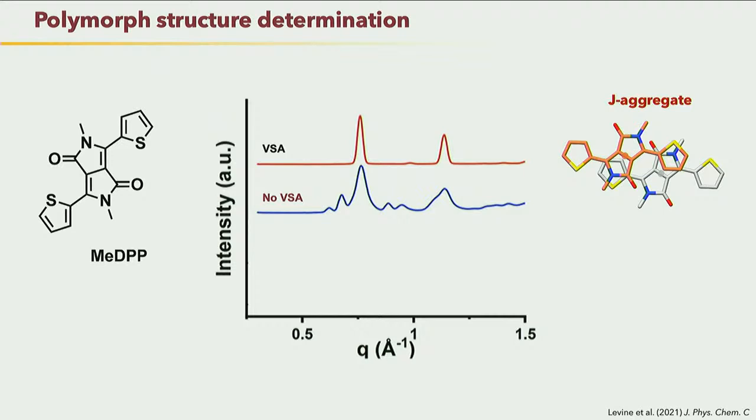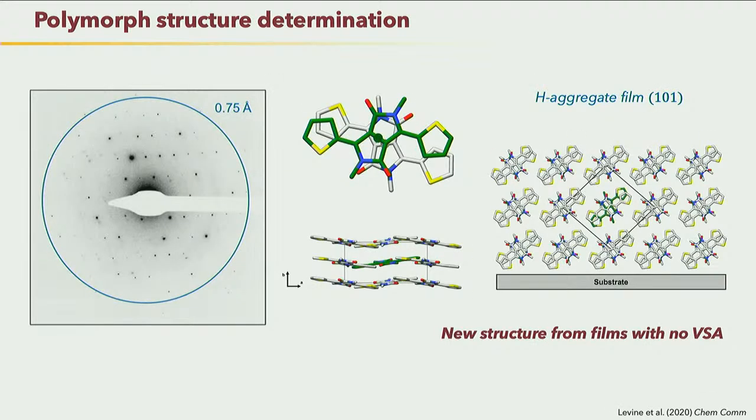And when we go through and we look at those grids, we see some crystals that are this J aggregate. We collected actually quite a few data sets of the J aggregate in that sample, but we also found something else in there. We started seeing crystals that, by eye, when you collect diffraction data, you start to pick up on these things. By eye, you say, these crystals are different than all the other ones we've been collecting. And so we started focusing on those. And sure enough, those were of this other unit cell. And you can see it's actually not very different at all.